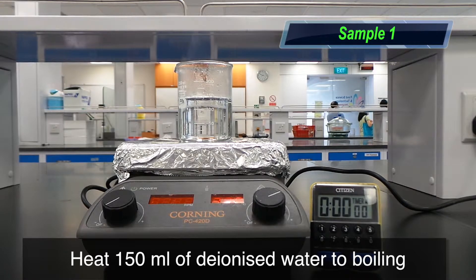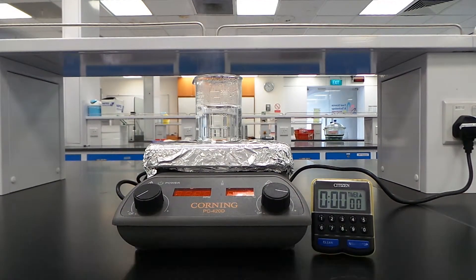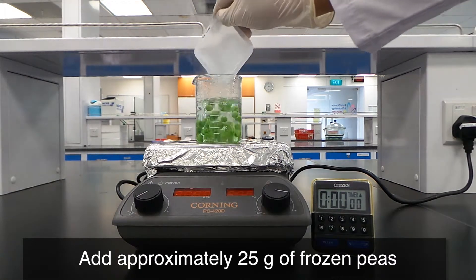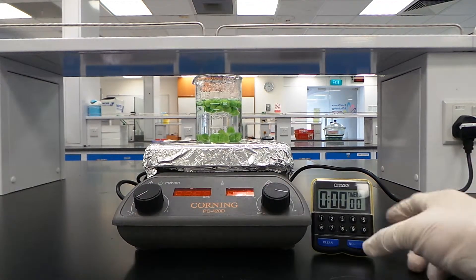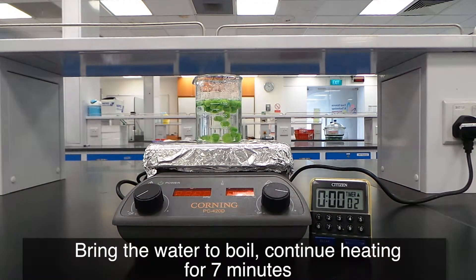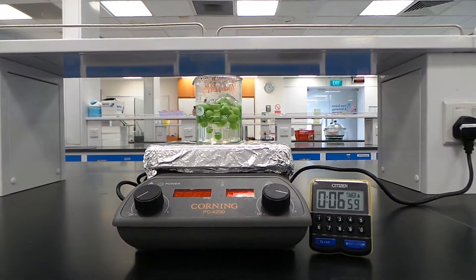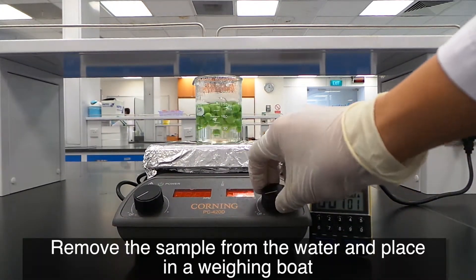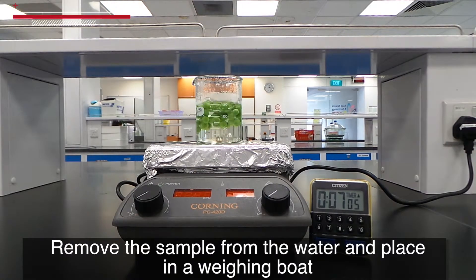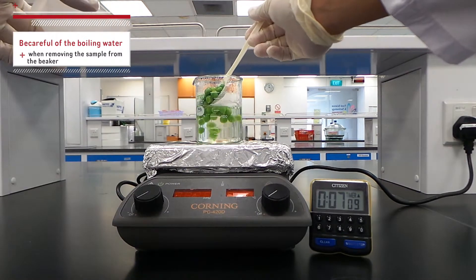Heat 150 ml of de-ionized water to boiling. Add approximately 25g of frozen peas. Bring the water to a boil and continue heating for 7 minutes. Remove the sample from the water and place in a weighing boat. Be careful of the boiling water when removing the sample from the beaker.